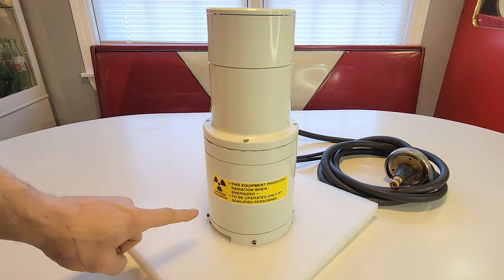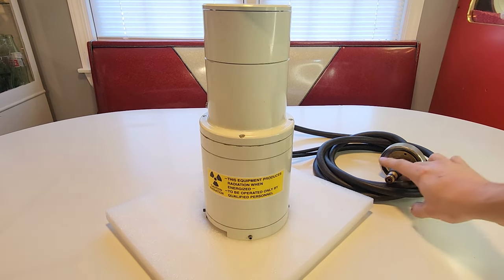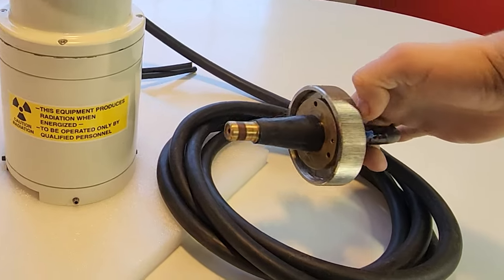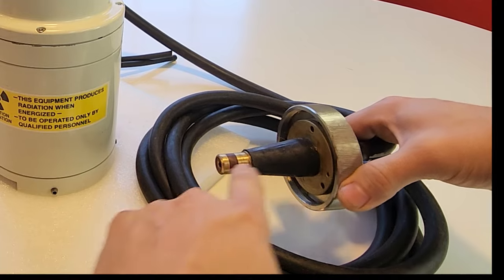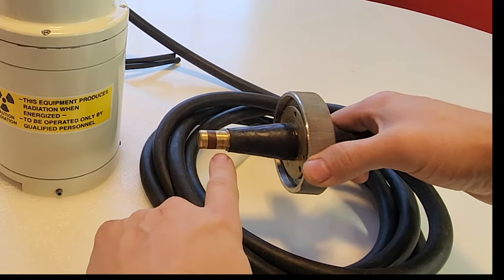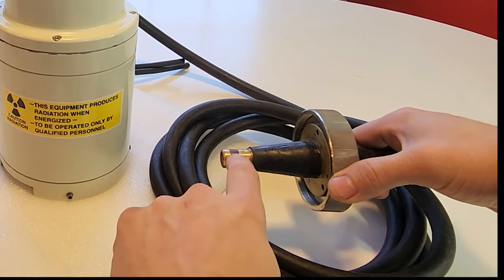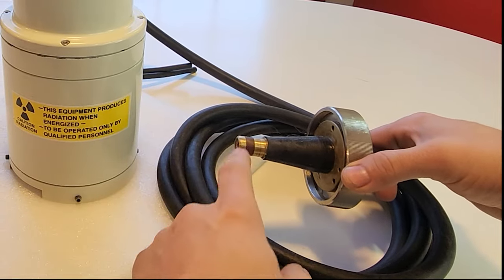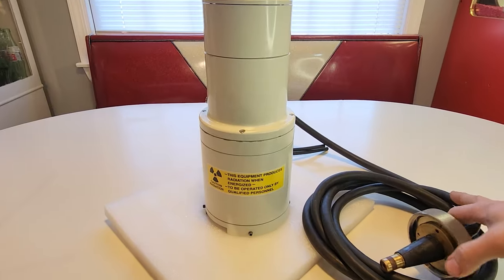First thing you'll notice, besides the radiation sticker, is the power cord — the power cord for the electron gun. This is the high voltage input, running many kilovolts, probably about 50,000 volts DC, and it has three conductors: a ground and two hots. It has two hots because there's a filament inside based at the higher voltages that powers the heat filament — the electron boiler — to get the electrons off, and then the high voltage accelerates them. This is a very high voltage rated cable.